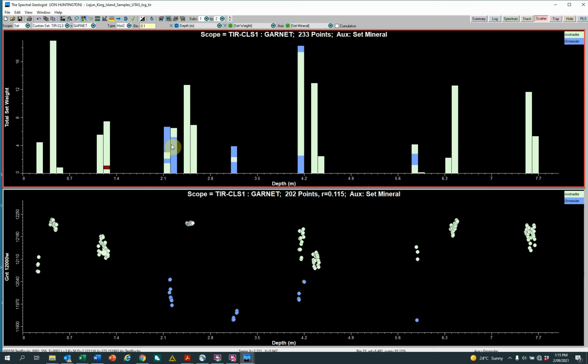Okay, so if there is indeed one mineral and the mix we see here is just a modeling artifact to try and model something which is actually in solid solution somewhere between andradite and grossular, then I can use the proportions of the mixing weights to estimate what the composition of the mineral is.